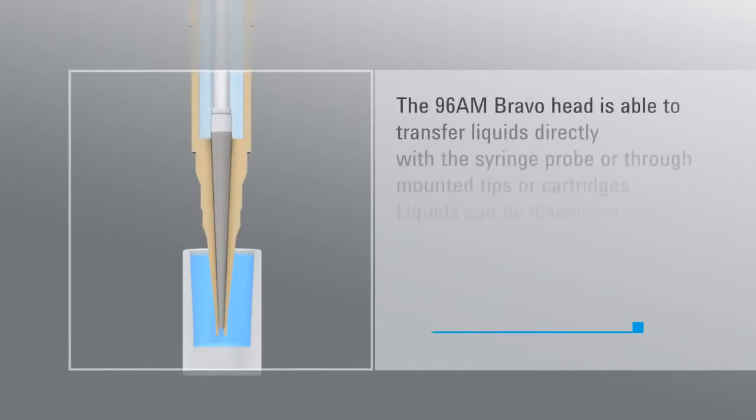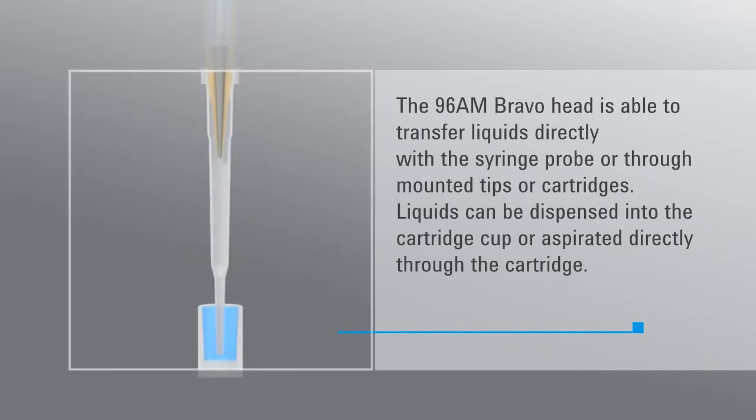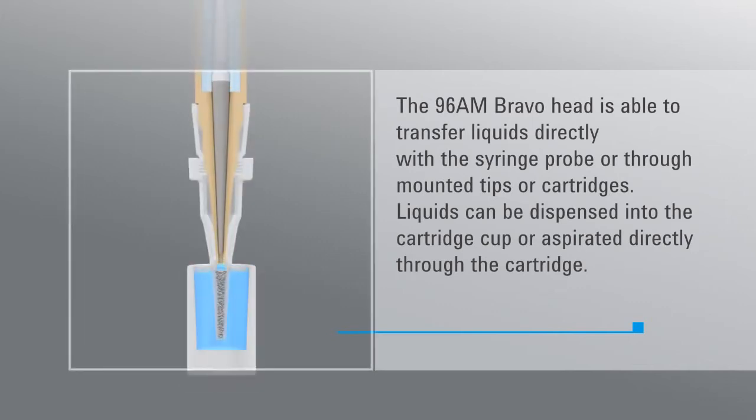The Bravo 96AM can transfer liquids directly using the syringe probe or through mounted pipette tips or AssayMap cartridges. Liquid can flow in either direction to the cartridge, enabling sample washing and recovery in the syringe or in a microplate. The Bravo liquid handler enables whole plate, row and column, and single tip liquid transfers.